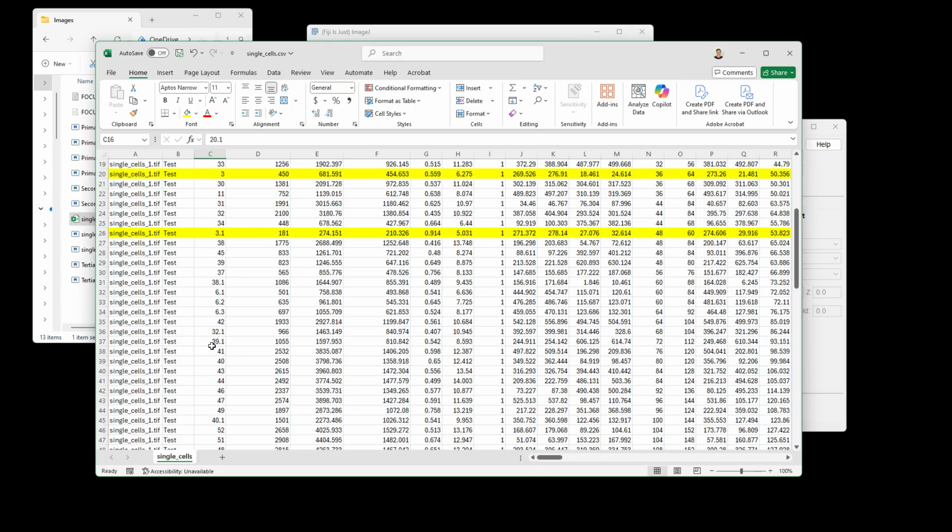The reason we chose to give this sort of information to the user in this way is that it could either represent a biologically interesting phenomenon that you're trying to investigate. Bi-multinucleated cells are a thing, but it could also represent an error in segmentation. Perhaps your nuclei are being split into too many pieces, and that's something that you can then visually see in your data and go back and correct and rerun your analysis.